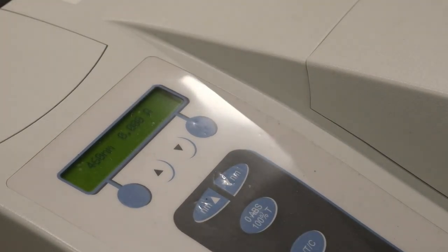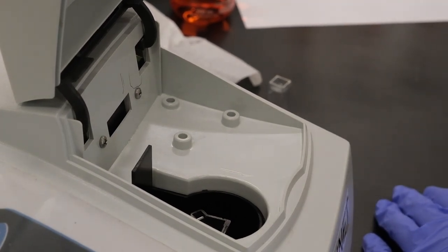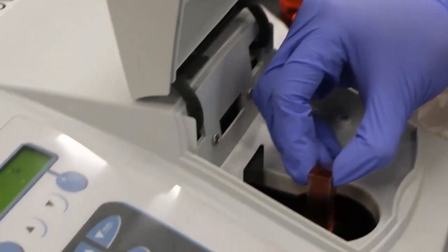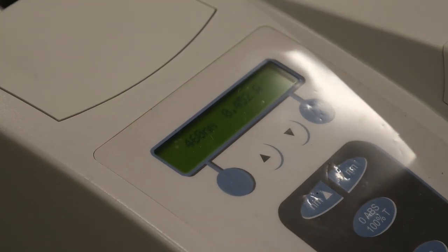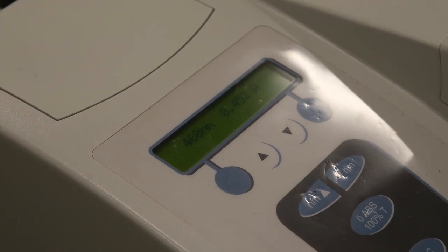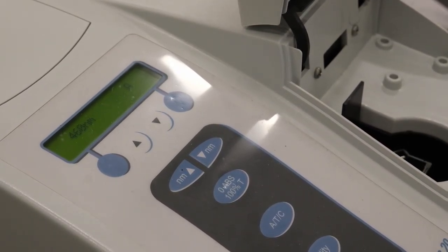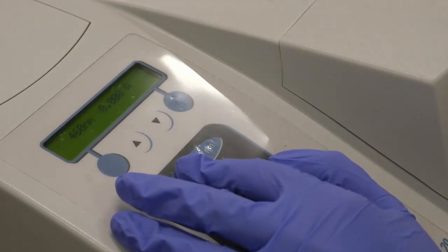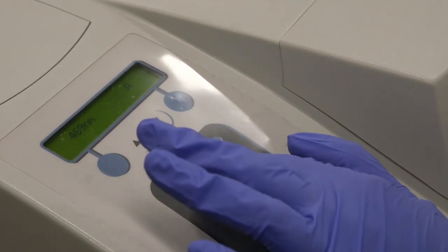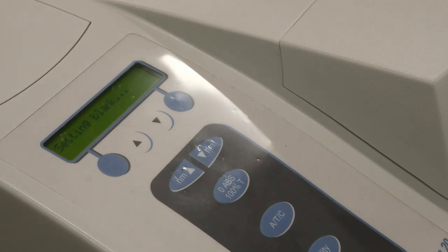Now at 460 nanometers, we're going to place the cuvette with the concentration inside. Now record the absorbance measured by the machine, to the correct number of significant figures. Now we're going to be going in 10 nanometer intervals all the way to 600. Well, in between each reading, we're going to be using the deionized water to blank the machine.